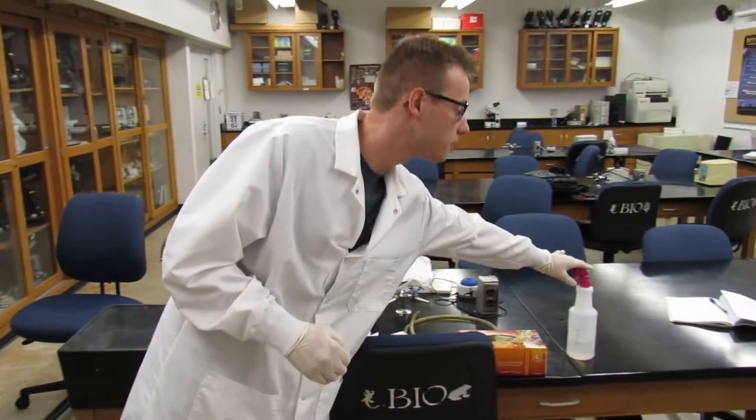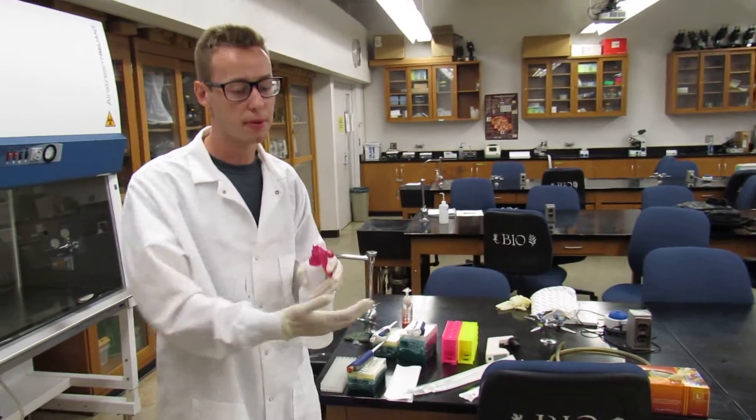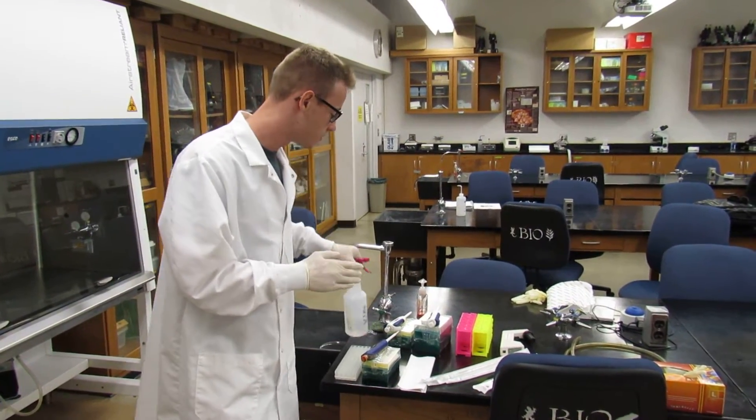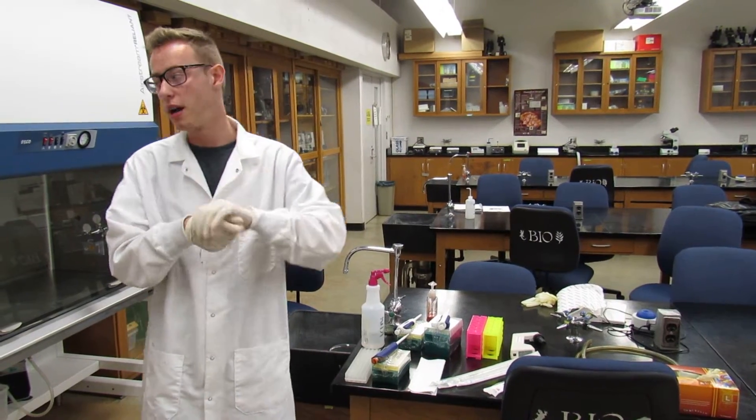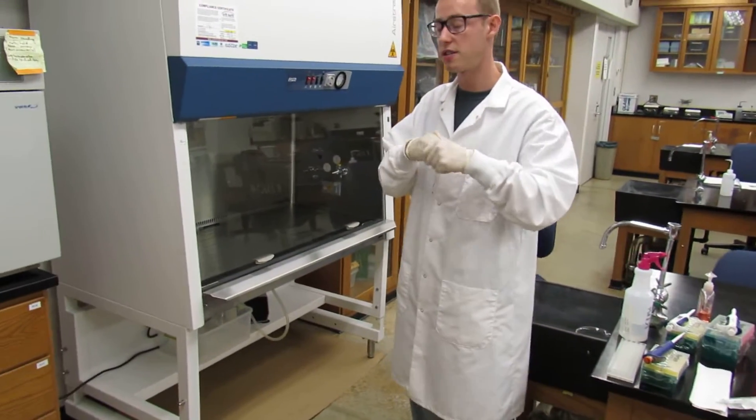Next, you're going to want to grab a pair of gloves and spray them with 70% ethanol like so. After you've sprayed and wiped down your gloves, you're going to want to move to a biosafety cabinet.